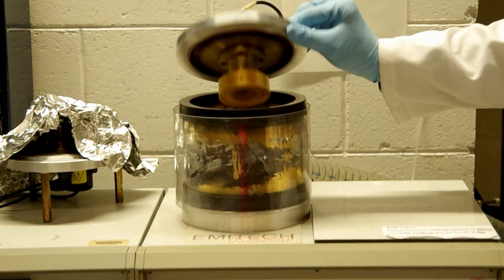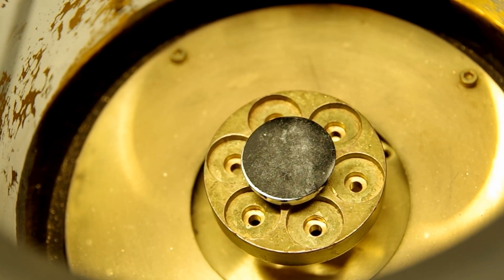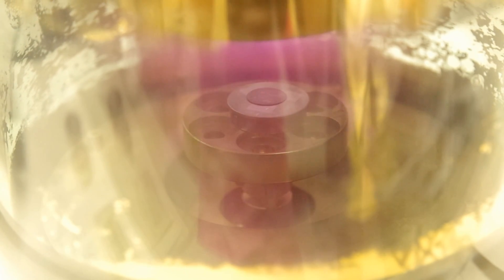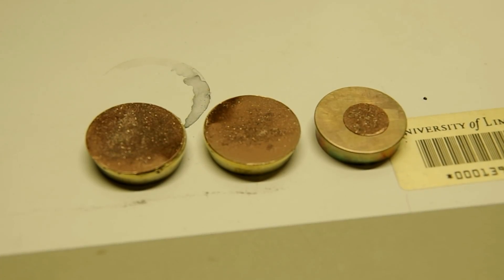Now, use gold sputter coating to coat the samples with gold particles to increase the thermal conductivity, reduce the beam damage, reduce the sample charging, and to improve the secondary electron emission in order to improve the image resolution. The gold coating is done.